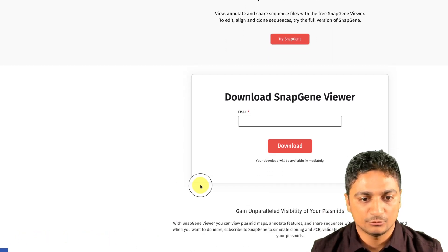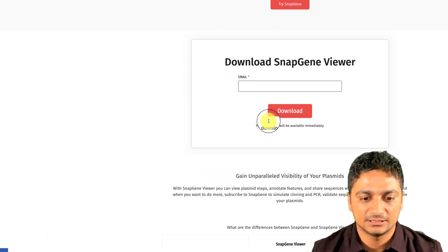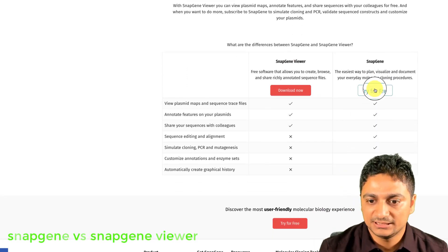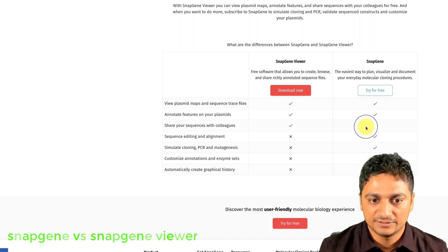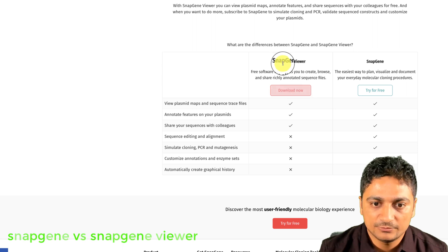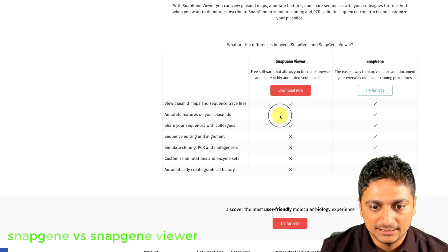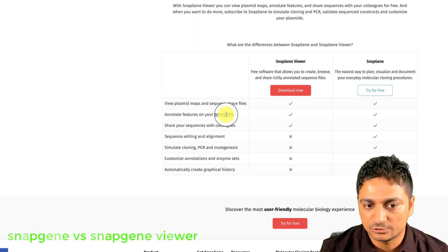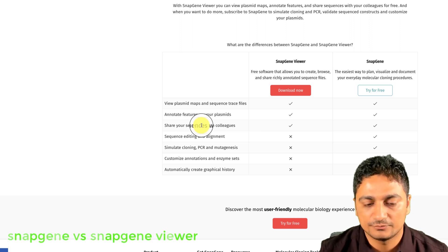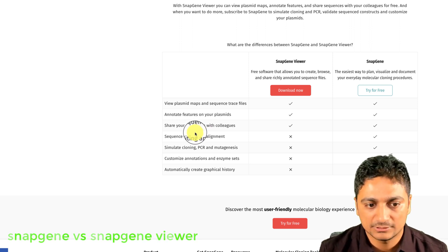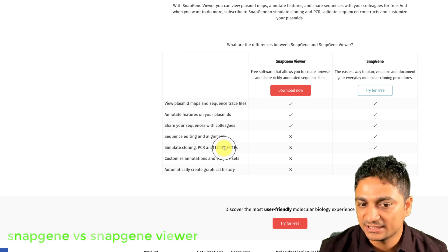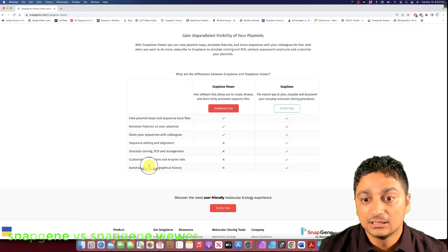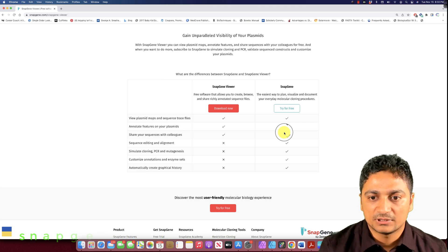To download SnapGene Viewer you just provide your email address and download it. Let's see the difference between SnapGene Viewer and SnapGene: SnapGene is paid software with all the features listed, while SnapGene Viewer is free with limited features. With the Viewer we can view the plasmid map and sequence, annotate features, and share sequences with colleagues. However, for sequence editing, alignment, cloning, PCR, mutagenesis, enzyme annotations, and automatically creating graphical history, you would need SnapGene.